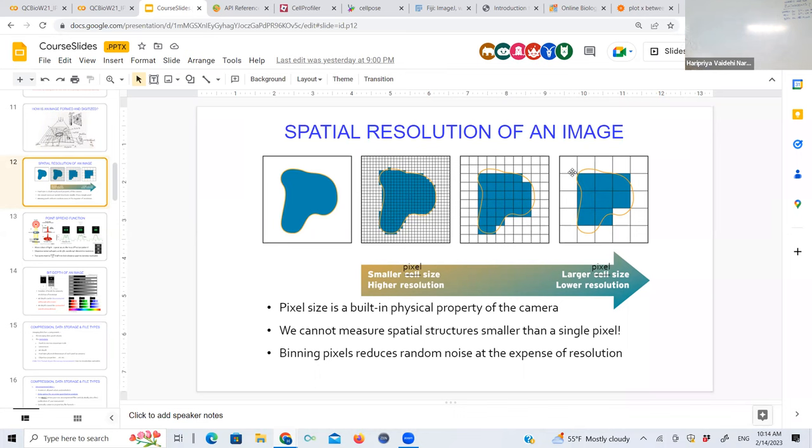Can you elaborate on spillover? Well, some shapes that are of not that whole pixel, but half. I don't know, maybe. Right. So that's a good consideration. You're thinking about it right, but I'm actually making it worse, right? Because if I bin, I'm losing detail there. So counterintuitive. I've been telling you you can't measure half a pixel, and here I am adding them.